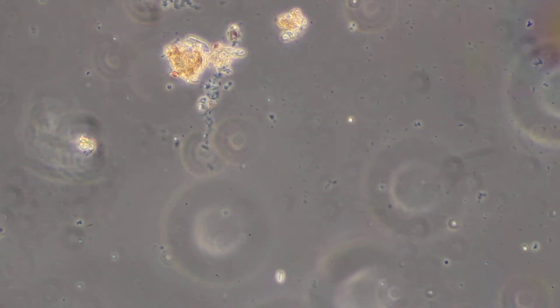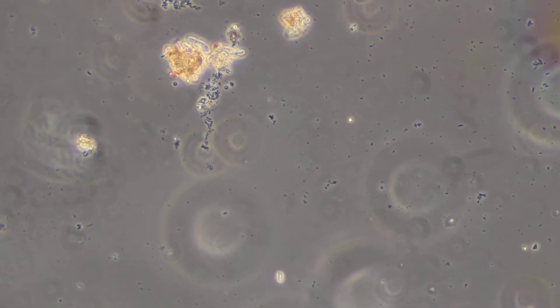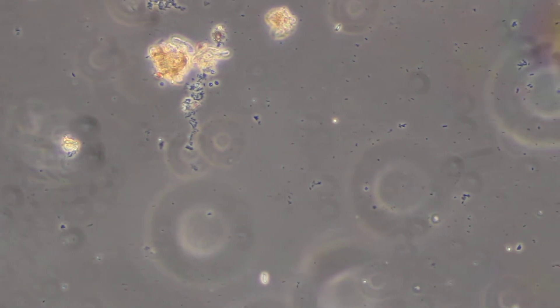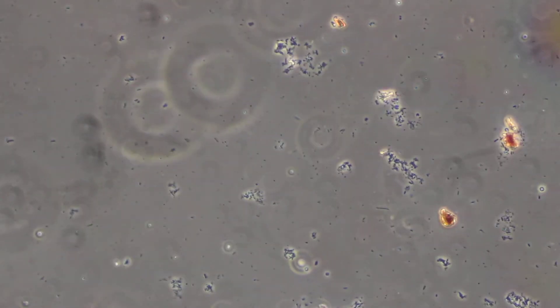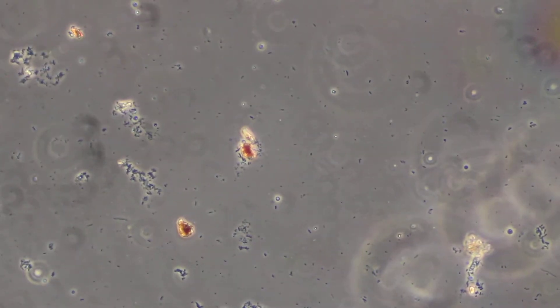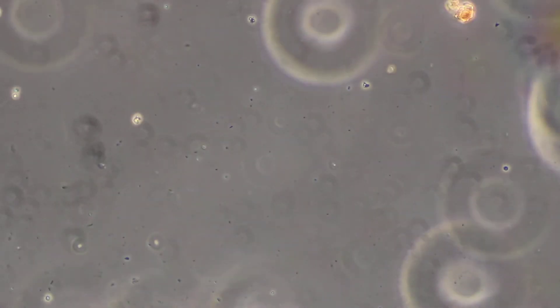By comparison, here's a kelp hydrolysate product. I don't actually know the manufacturers — I got this from a friend to take a look at. As you can see, there's just not a lot going on here. This is at 200 times magnification. There is some bacterial biomass and a few flagellates cruising around, but for the most part, it's fairly dead.